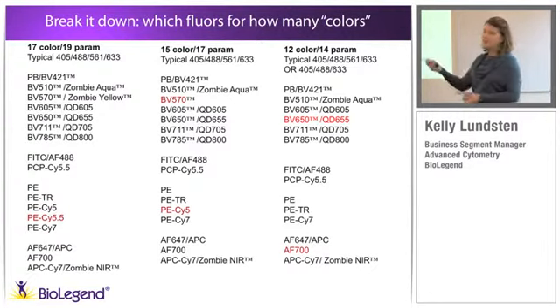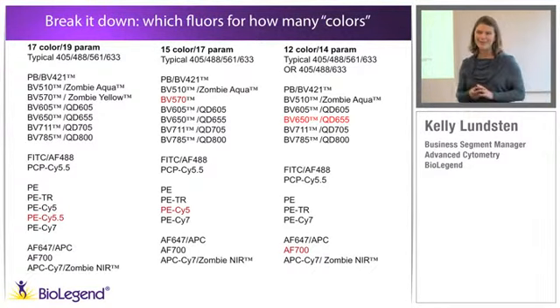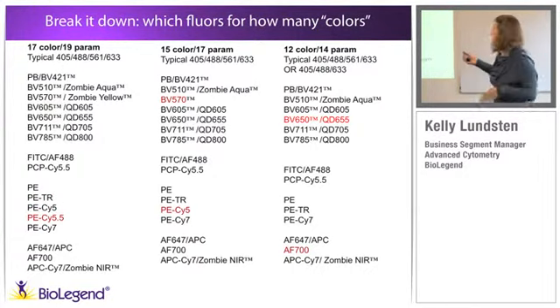And honestly, PE-Cy5 would be dropped number 1 because I'm going to show you a lot of information about how that can very quickly screw up an assay. I like to use PE-Cy5 on any marker that I know I'm going to dump, like NK1.1 or something else that mostly I'm using a marker for in order to negate it from my analysis. That's a very quick way of removing the contribution of that fluorophore to my analysis.